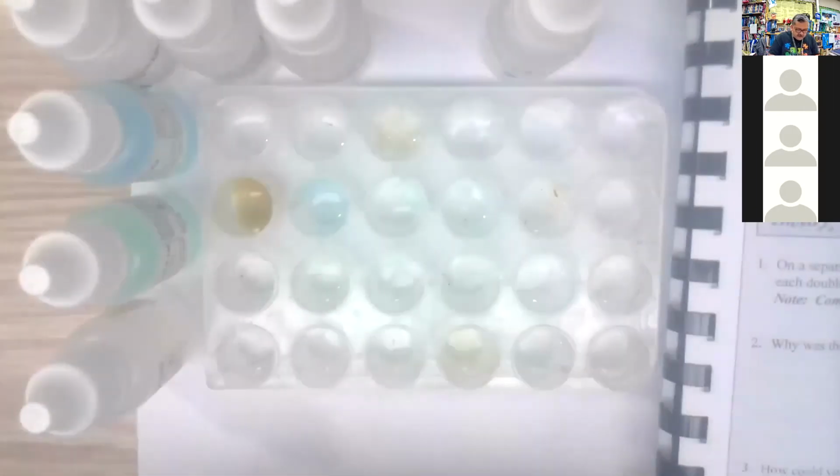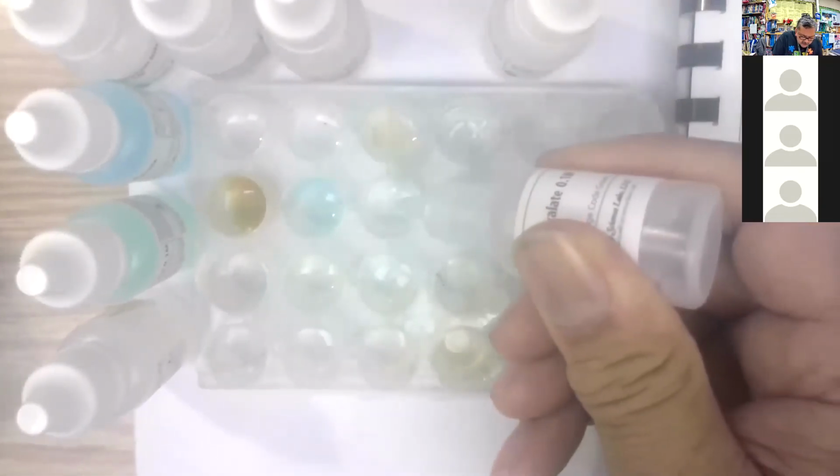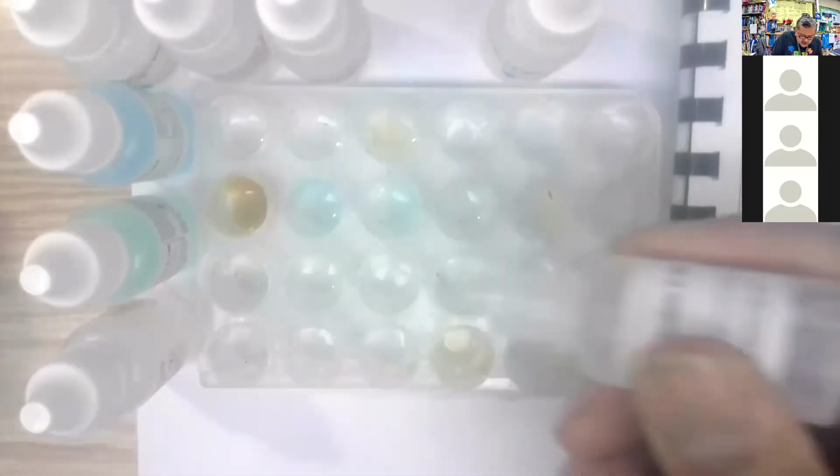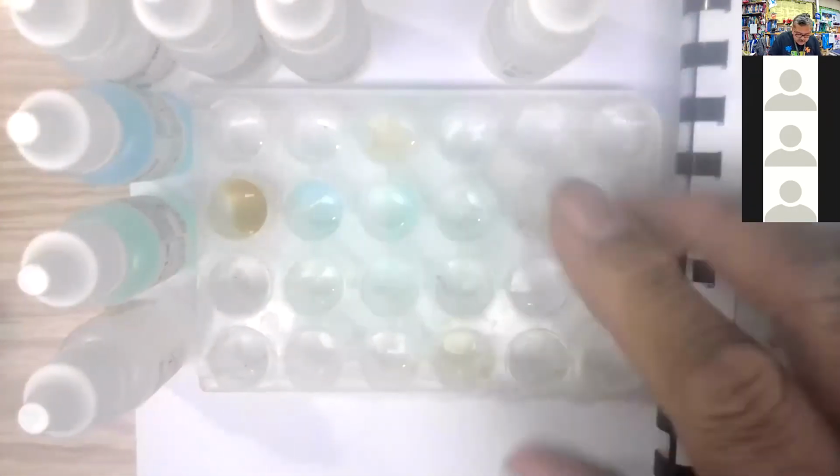All right, let's go with the sodium oxalate. Going down this way, shaking it up again. Going to the third column, 3 drops in each of the wells. Here we go. Ready? 1, 2, 3. Powdery white. 1, 2, 3. Kind of blue. 1, 2, 3. Not really. 1, 2, 3. All right. So significant color changes. White here. Blue here. This one goes from clear to white. This one is going from clear to blue.